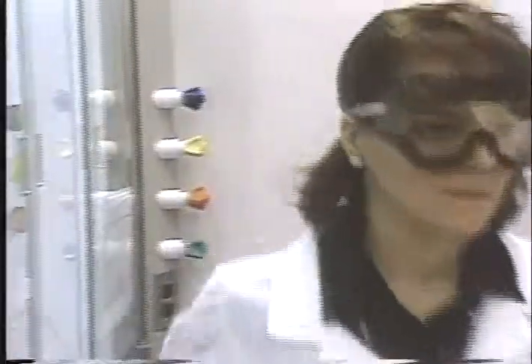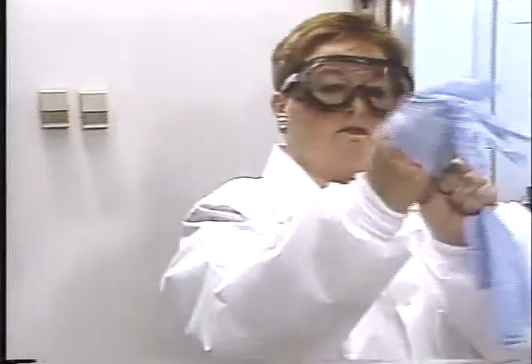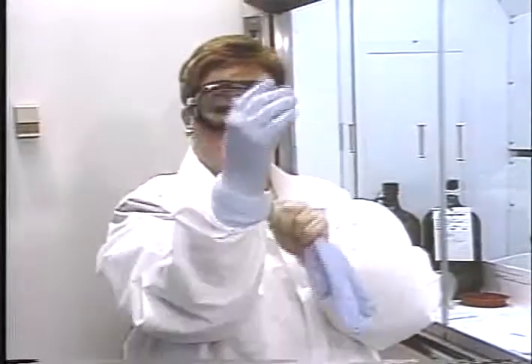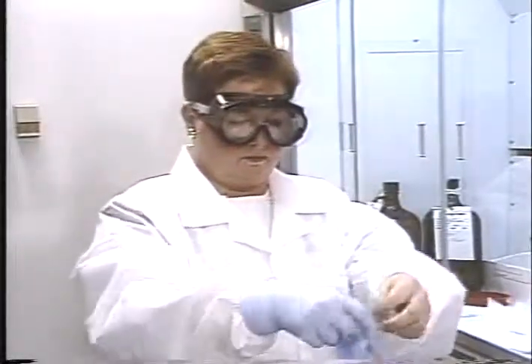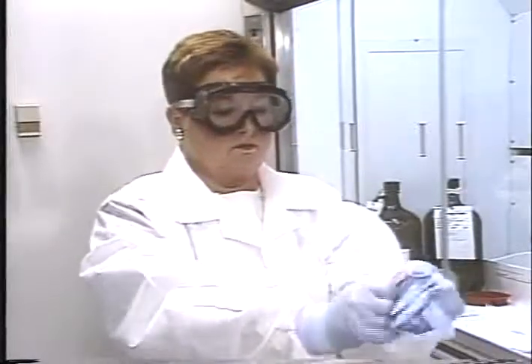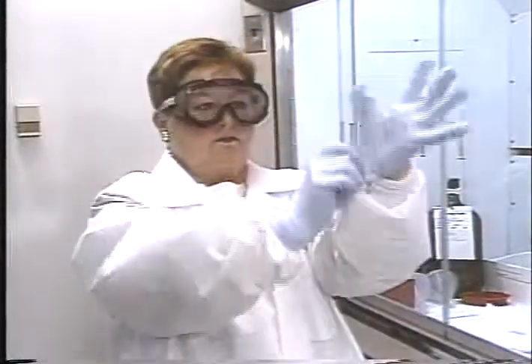The most basic way of shielding yourself from hazardous levels of exposure is through personal protective equipment. Gloves are a good place to start. Protective gloves are often designed for use with specific substances or hazards. For maximum protection, OSHA requires you to choose gloves that are impervious to formaldehyde solutions of 1% or more.